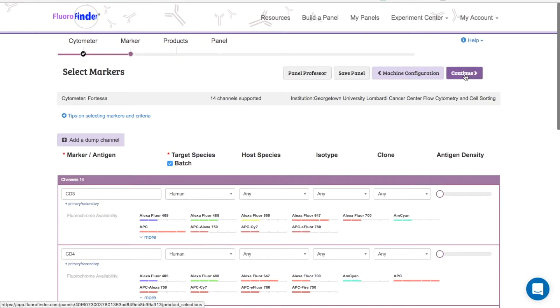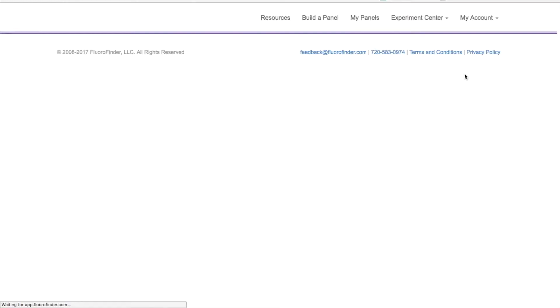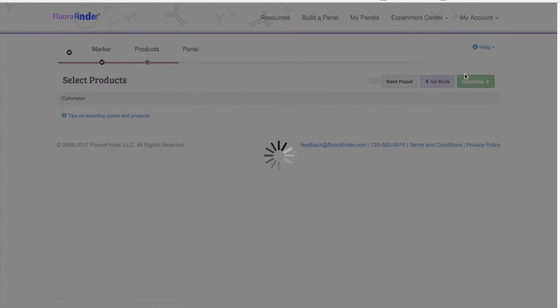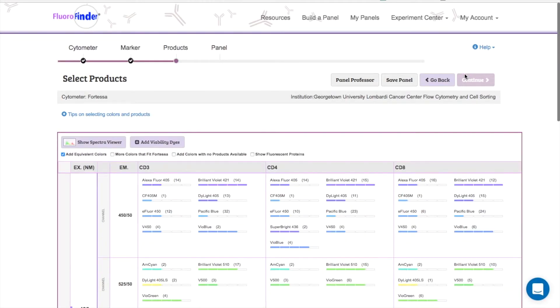Once you have finished entering all of your markers, use this button to continue on to the next step, where you will select from a list of products that fit your machine.